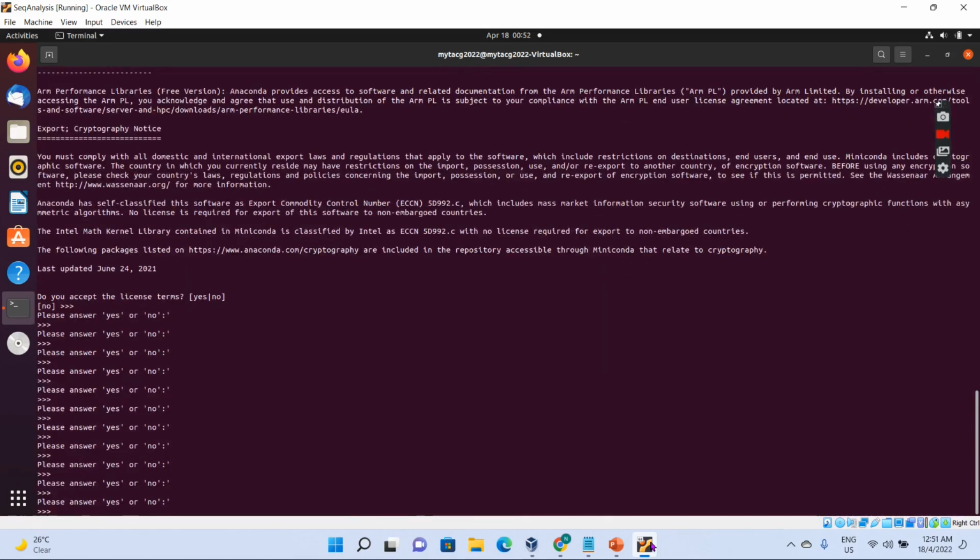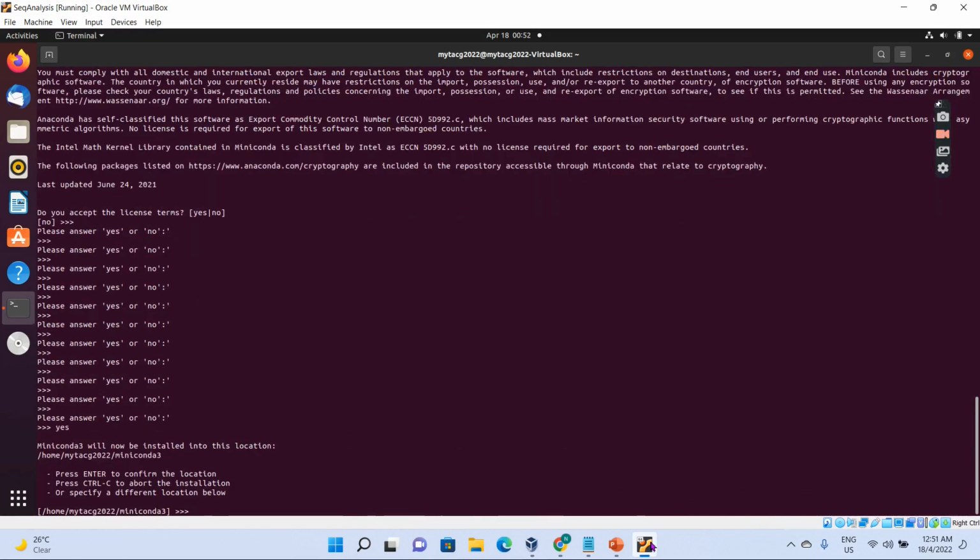And then after that, just type yes, you agree. Here also just press enter to confirm the location. This is the pathway where the miniconda or the Bioconda folder is located in your home directory. So just press enter.